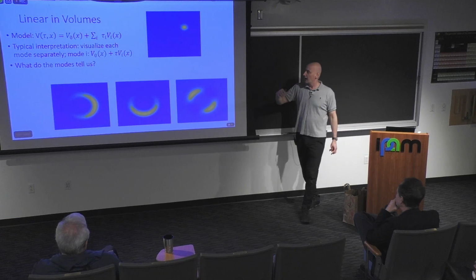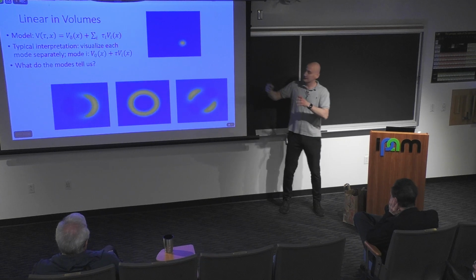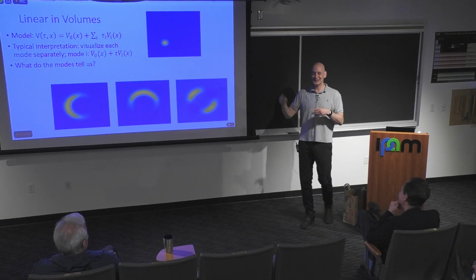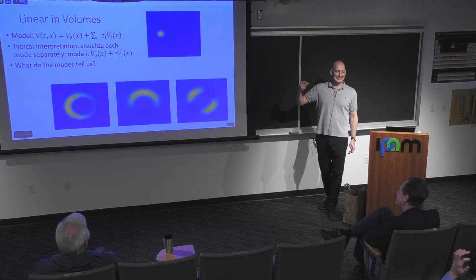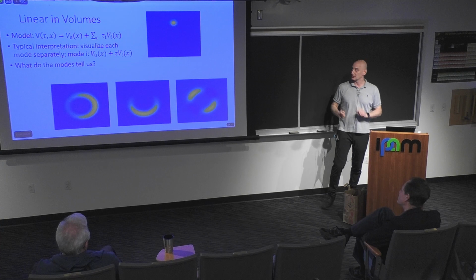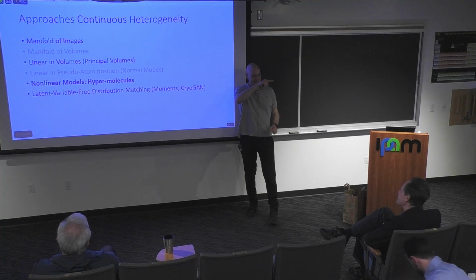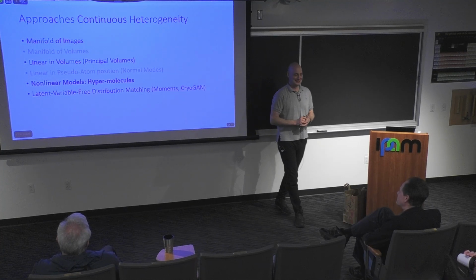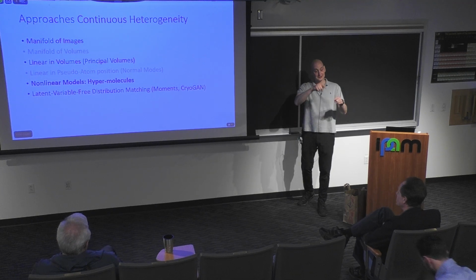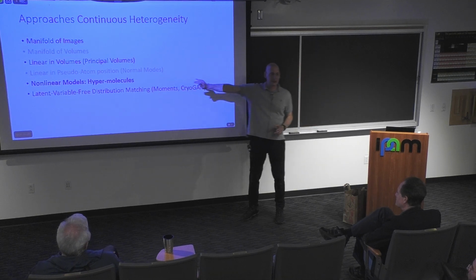And I'm not talking about this here, but there is a lot of work trying to combine, for example, manifold learning, work by some of the Amits in this room, combine manifold learning with these to take this to the next level. But this is one of the issues with the linear models. So again, I'm skipping normal modes. Normal modes would get this, what Stephen here was thinking would be the normal mode. These are the normal modes in these models. But I'm going to skip these, and I'm going to talk about nonlinear models.